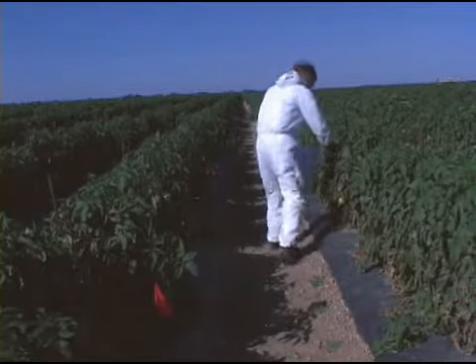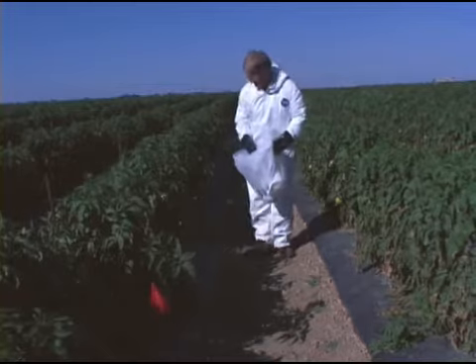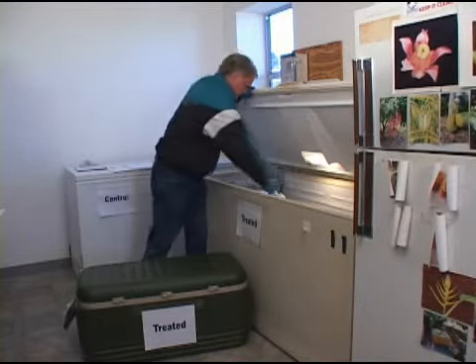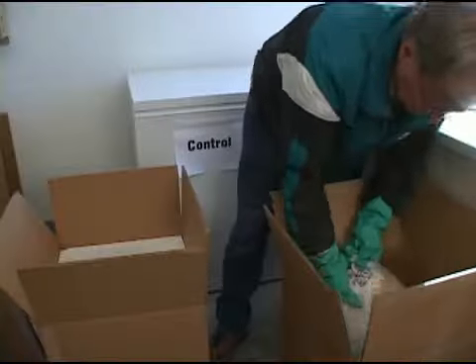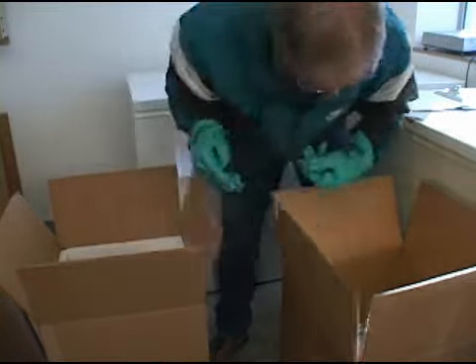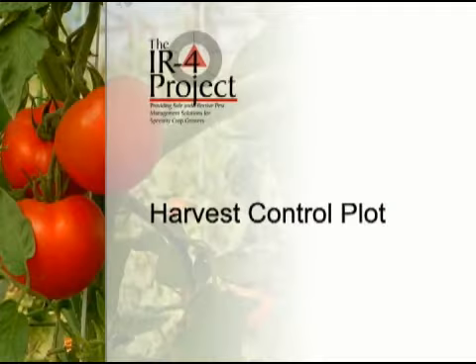After 1 hour, when the pesticide has dried, you can begin harvesting the treated plot. After harvesting, take the samples to the freezer. You should then prepare and ship the frozen samples in insulated shipping boxes containing dry ice, according to the protocol. During the entire study, you should enter information into your raw data book.